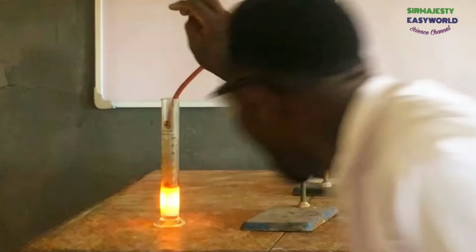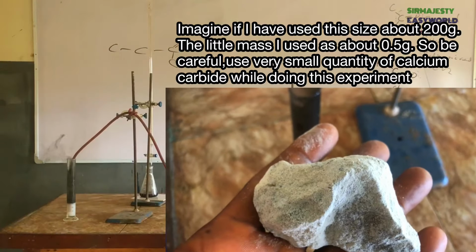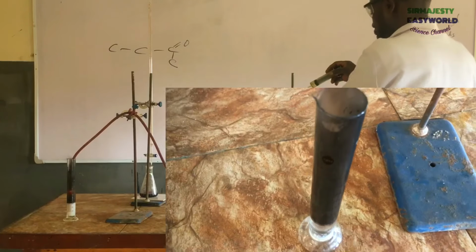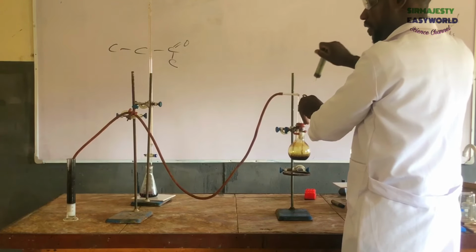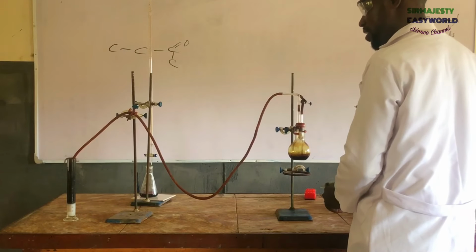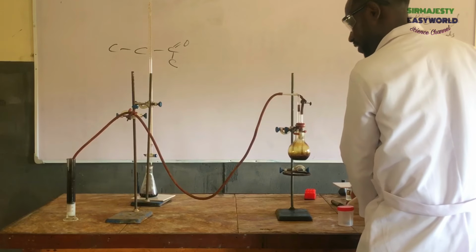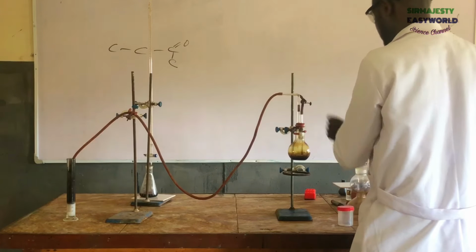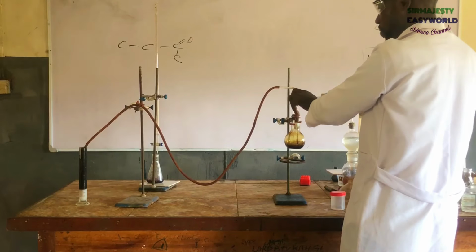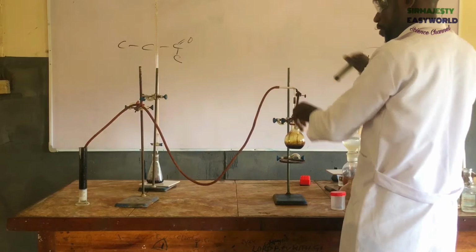Oh! Oh, you see the black soot? This is very interesting. That black soot of carbon, I guess I'm going to increase the chlorine. Okay. Wow. That's amazing. Oh, you see that? I said we might see an explosion. So we are on a mission where anything can happen.